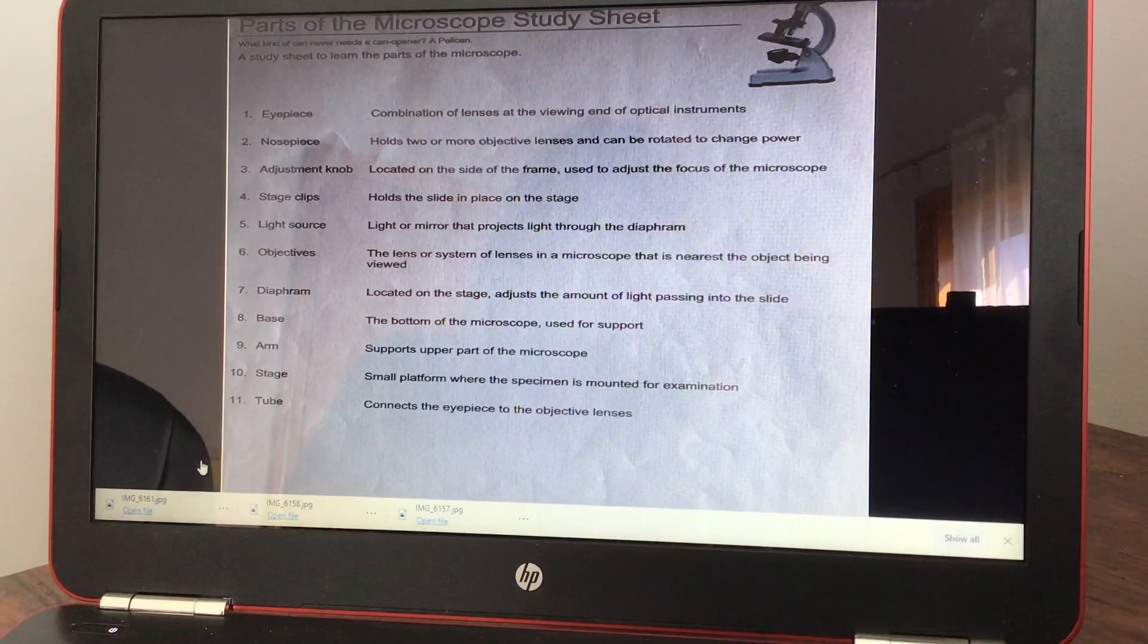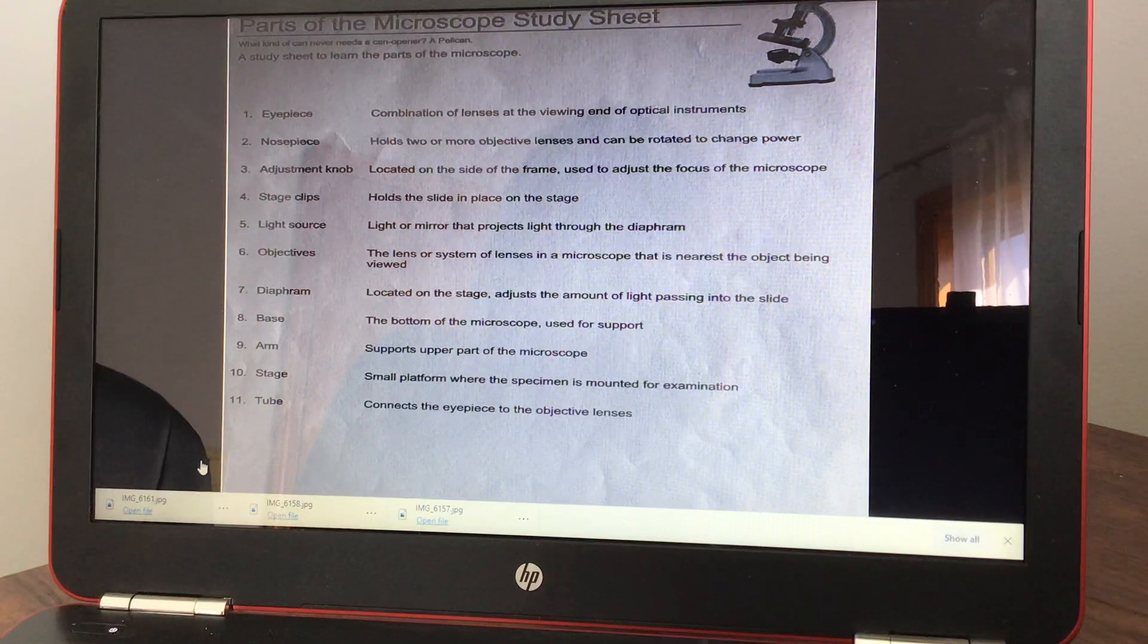Number three, adjustment knob: located on the side of the frame, used to adjust the focus of the microscope. Number four is stage clips, and it holds the slide in place on the stage. Number five, light source: the light or mirror that projects light through the diaphragm.